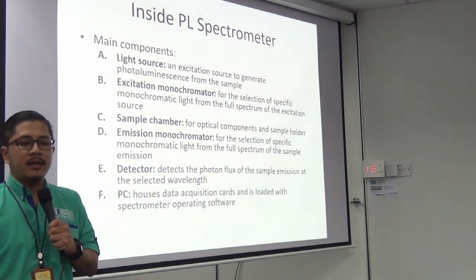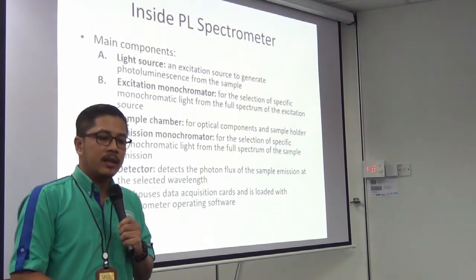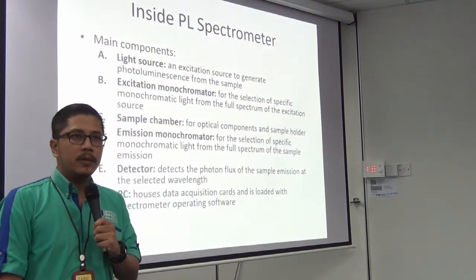Second last is the detector, to detect the photon flux from the sample emission at the selected wavelength. And of course we need a PC, which processes the data and gives you the graphs.